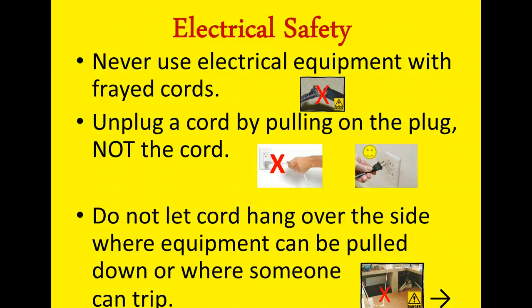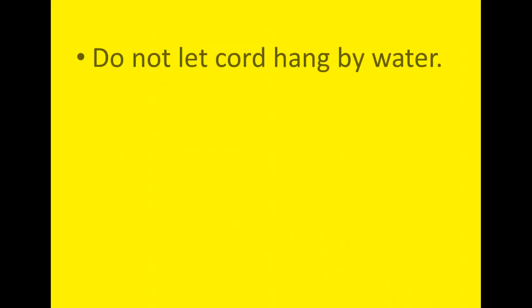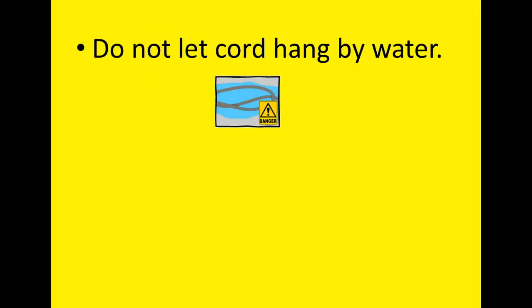Okay, we have a few more under electrical safety. Do not let the cord hang by the water. Sometimes we will be doing labs by the sinks. We may be using a lamp, or we may be using the microscopes, and they all do plug in. So make sure, first of all, that the plug is not hanging into the sink itself, but more importantly, as people wash their hands, that the counter itself is not wet. You don't want a cord hanging in the water, because that's just a recipe for being electrocuted.